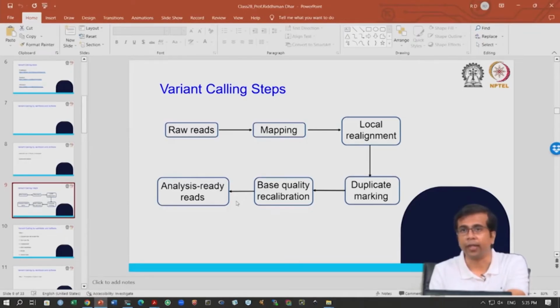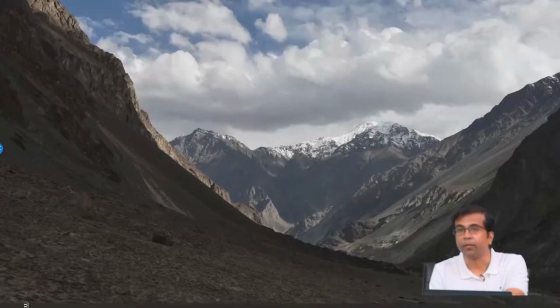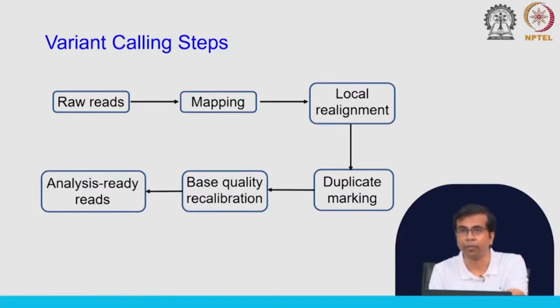So, again we can search for this command through the manual pages, etc. But of course it will not be possible for us to complete the full variant calling pipeline in this class if we do that, right. So, what I have done is I have also compiled all those commands that we will use for doing this variant call, and we will simply run them, and I will show you that at the end we get the variants. Okay. So, there are multiple steps.